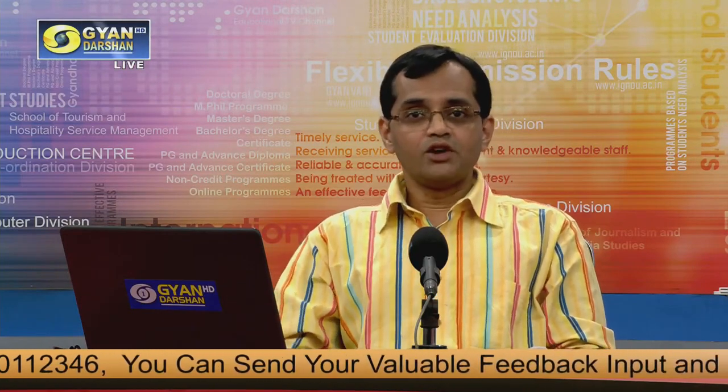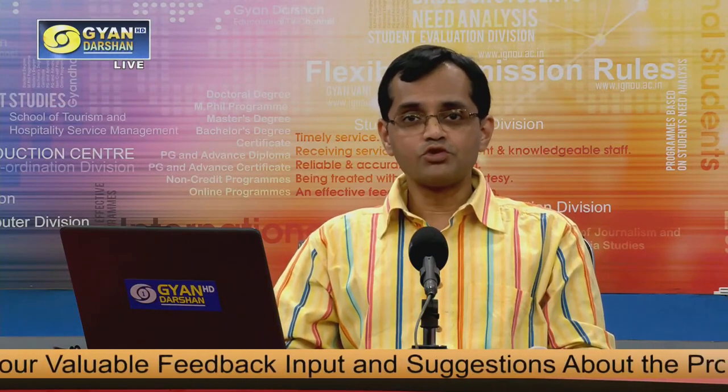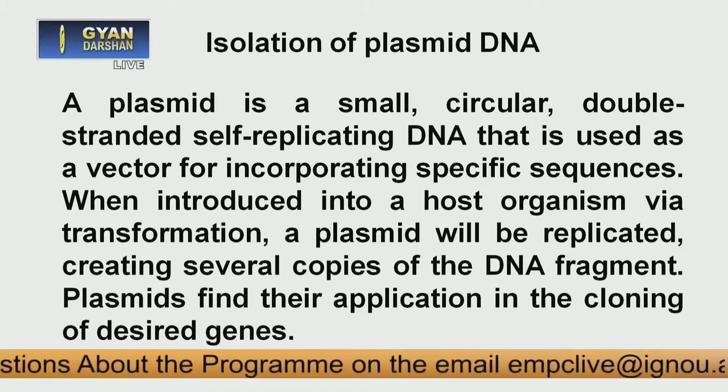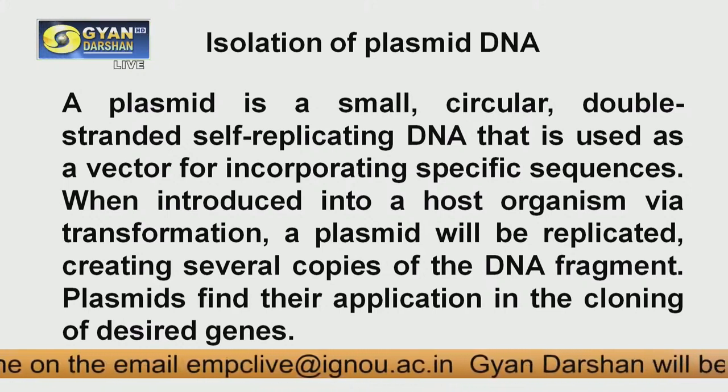Now, when we are discussing isolation of plasmid DNA, first of all you should know what a plasmid is. So I will give you the basic introduction or the principle, and then I will go into the technical part, that is how you will do the experiment. So what is a plasmid?